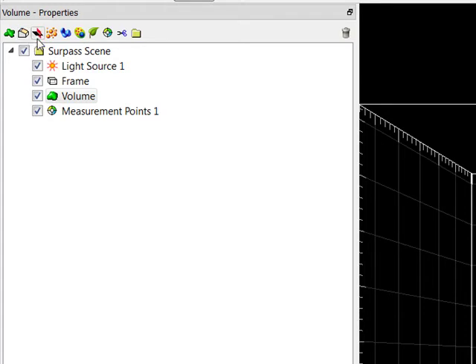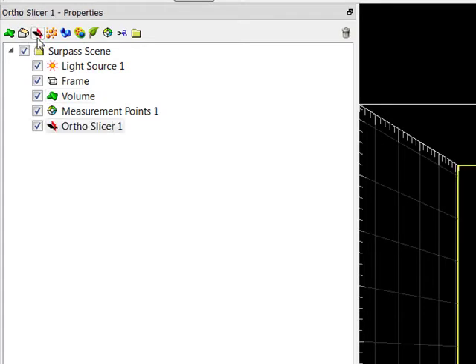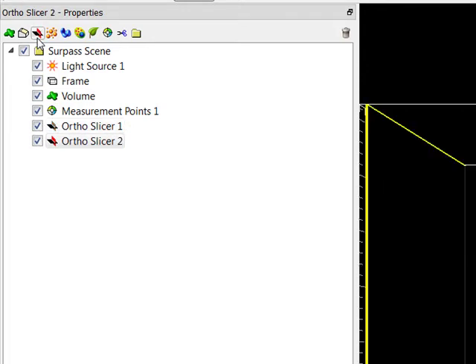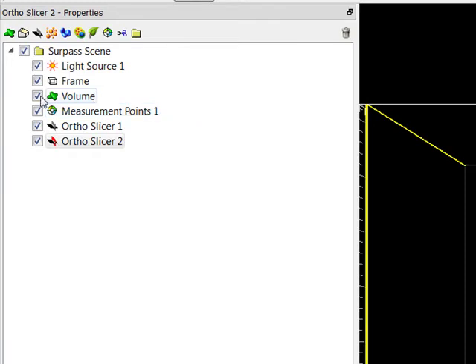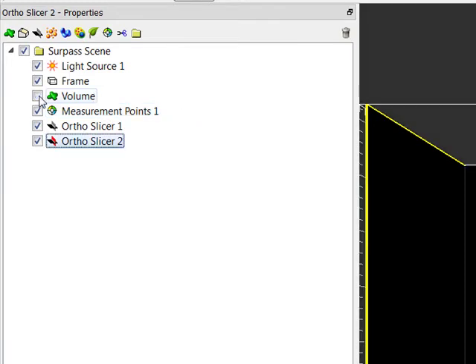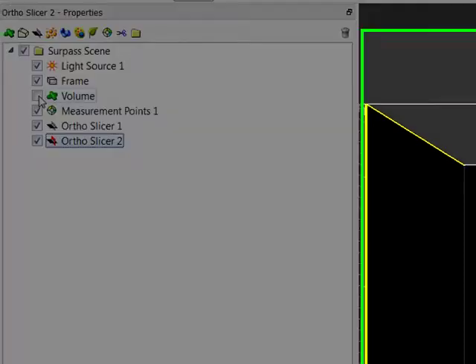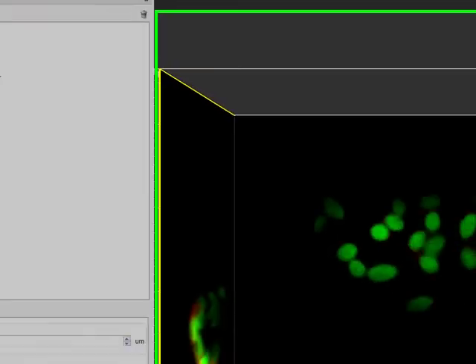To start adding measurement points on a specific plane, first add new slicers in the surpass scene. Please note that within the measurement points tool, any added surpass object is considered to be a solid object. Switch off the volume rendering to provide an unobstructed view.